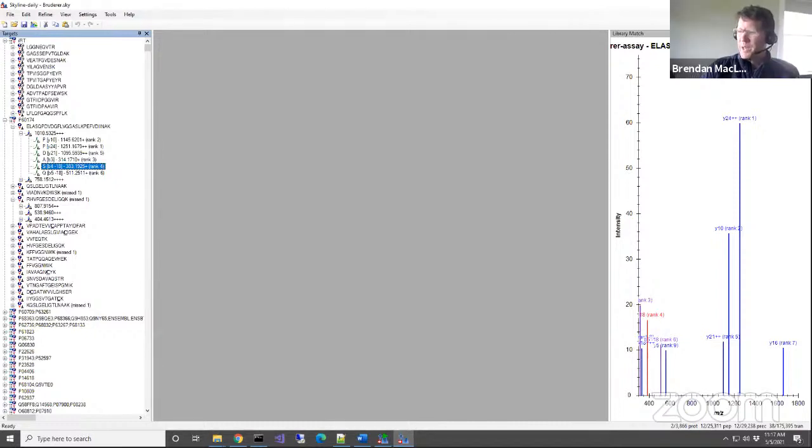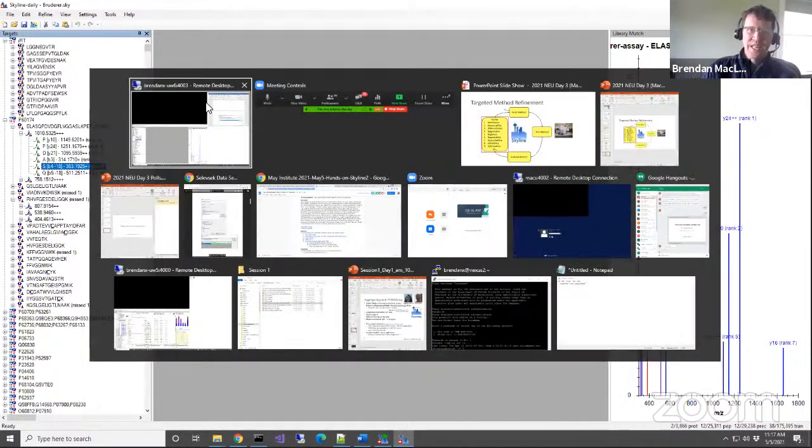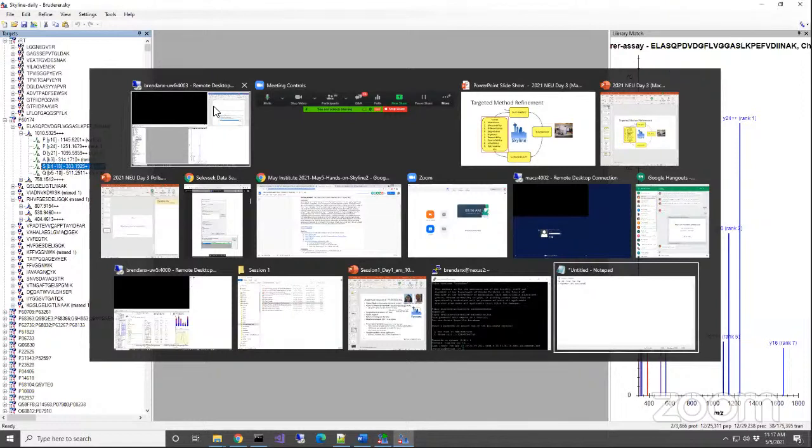Where can we find a one-day mass spec course for beginners that Brendan just mentioned? One-day mass spec. So again, yeah, I don't know exactly, but you can get to more beginning material than was presented here.